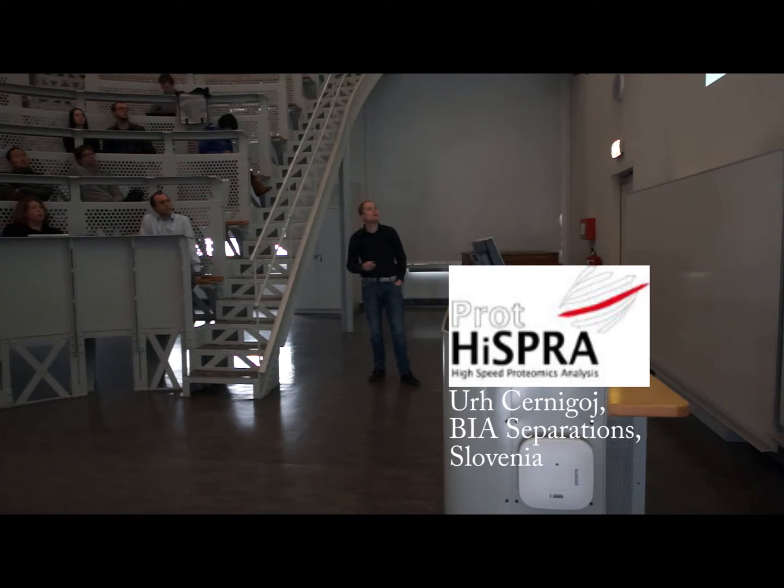And this is then the SEM image after the immobilization. And you can see these small needles. This is actually the titanium dioxide which covered the surface of the previously more smooth monolith surface. And we even measured the surface area of the composite material. Before it had around 7.7 square meters per gram.